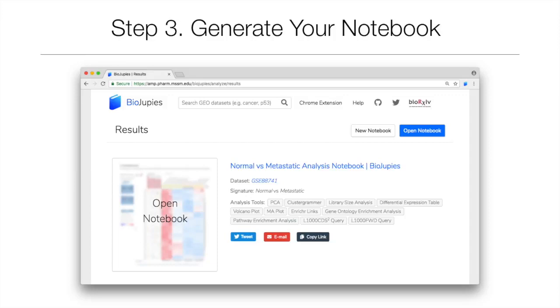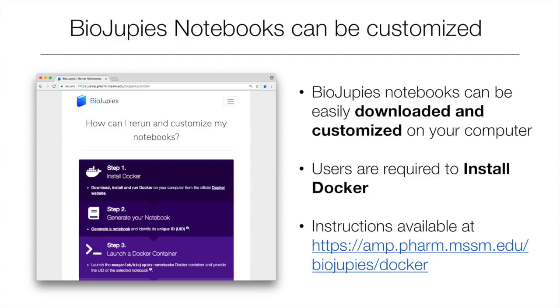For a step-by-step overview of the contents of a notebook generated using BioDrupees, see video 6. If a user wishes to download and customize their analysis, they can do so by using the Docker container provided on the BioDrupees website. For more information on re-running analyses on your local computer, see video 7.